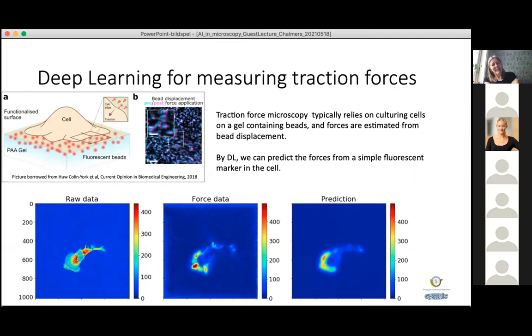And in general, when you work in microscopy, one of the powers of deep learning is that you can play tricks with the data, and you're always fighting to overcome complicated imaging methods and toxic imaging approaches, to enable a more natural environment for the cells, cheaper imaging, and the possibility of scaling up imaging.